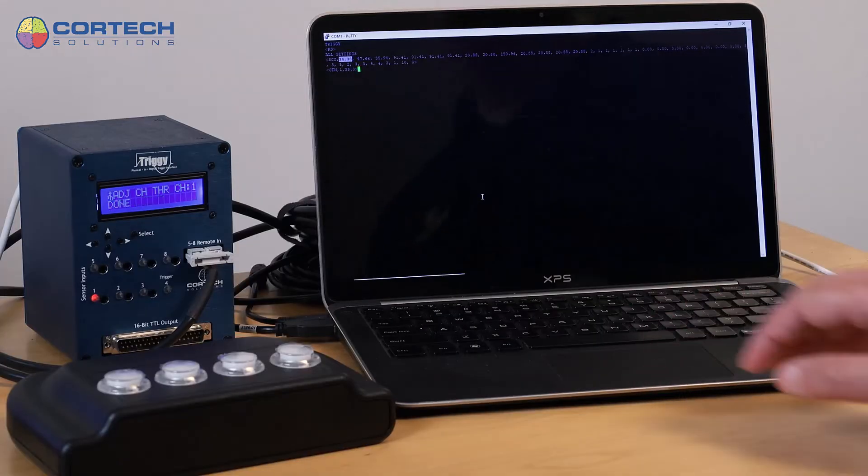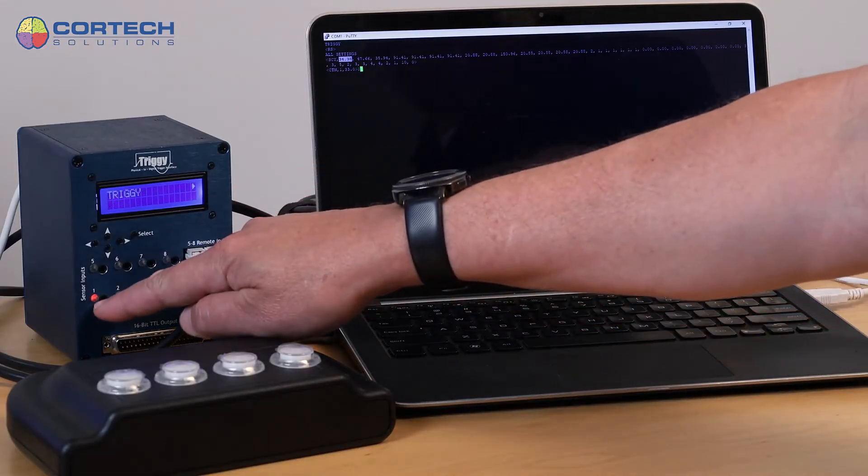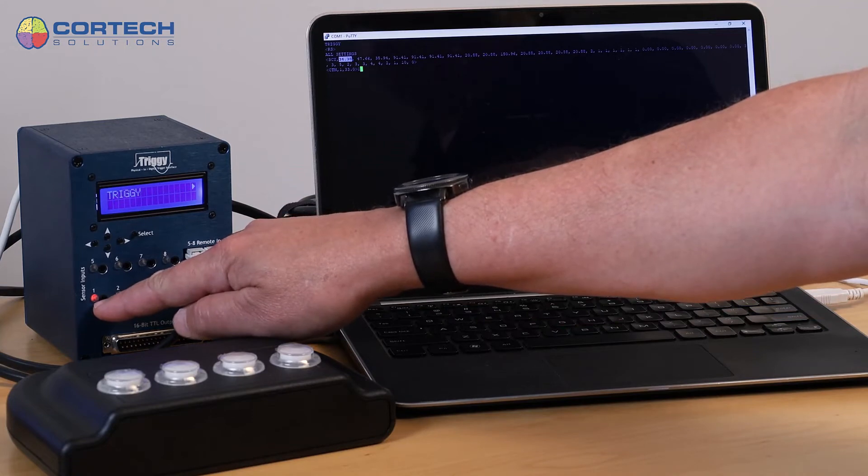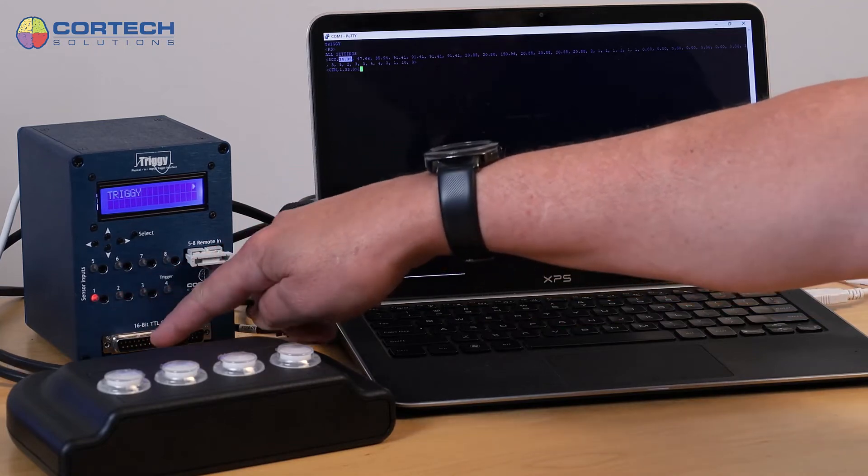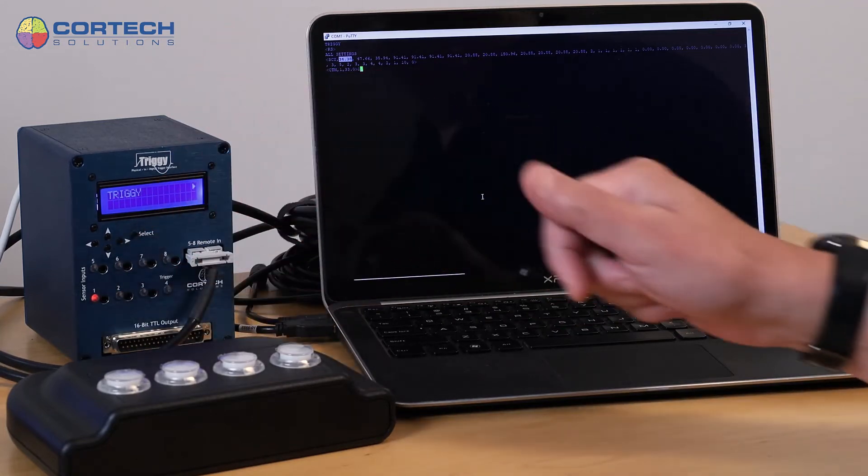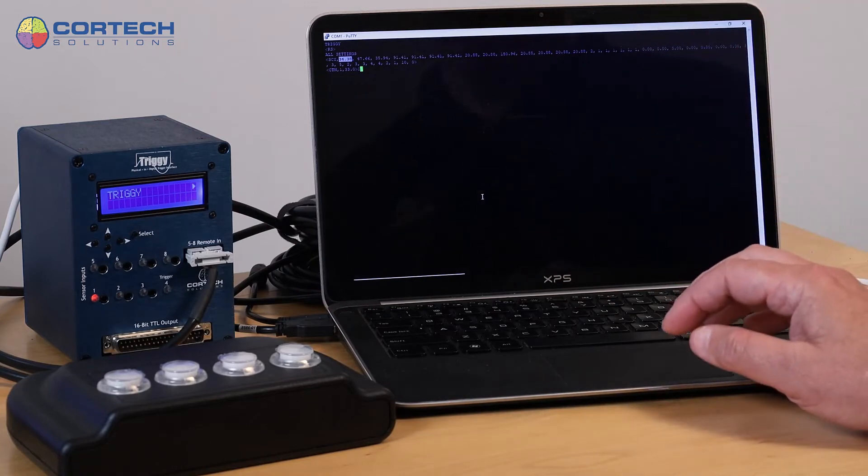And you'll see that the LED on that channel goes high, meaning the output bit connected to that is up. It's at max.